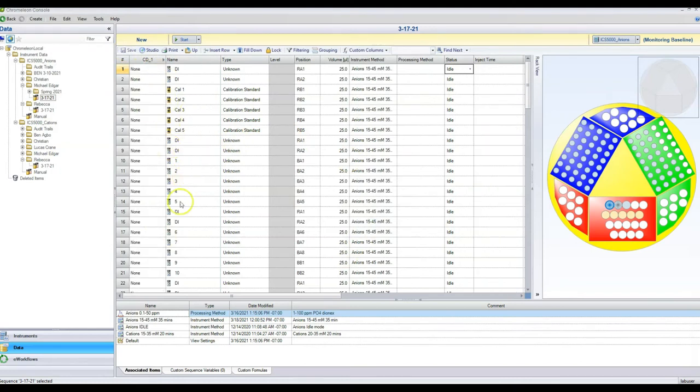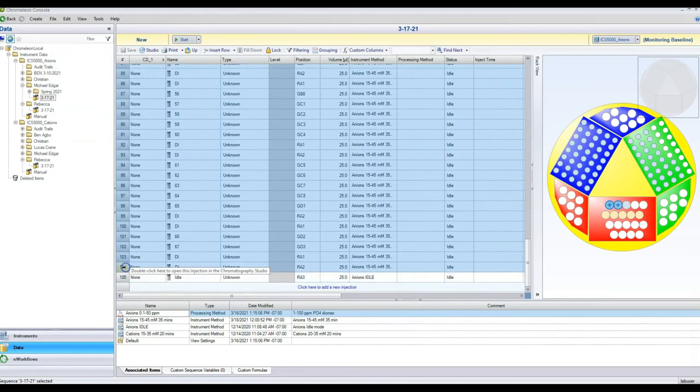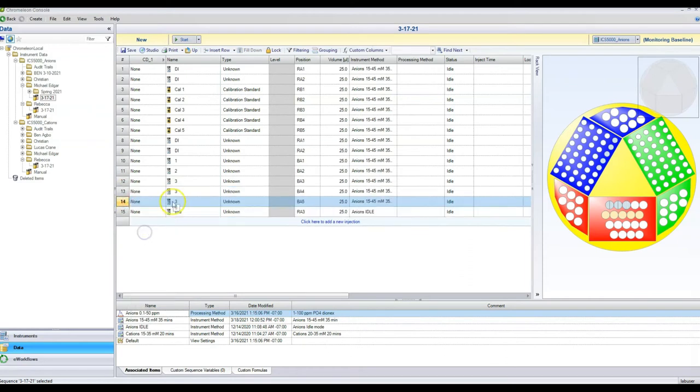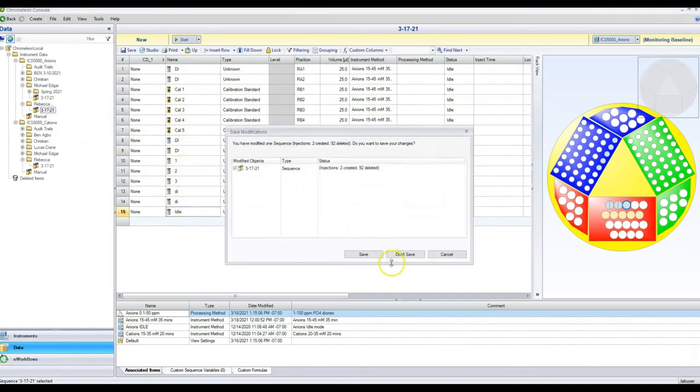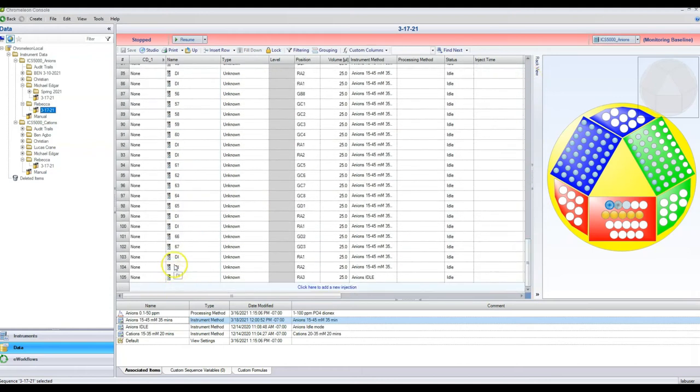Once it loads, you can start editing. Delete the extra samples you don't need. Every run should end in idle and should actually end in two DI waters. To insert samples, just right-click and hit Insert. The normal sequence is: two DI waters, followed by your calibration curve, followed by two DI waters, then your samples. When measuring samples, go five samples, two DI waters, five samples, two DI waters — keep that trend going until you end with two DI waters and your idle mode.